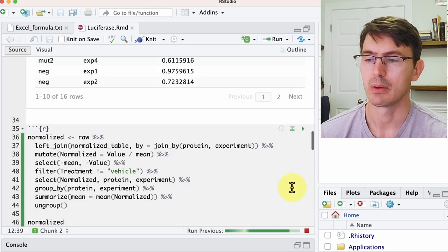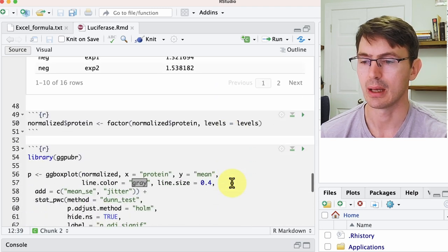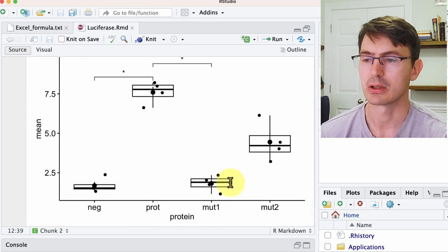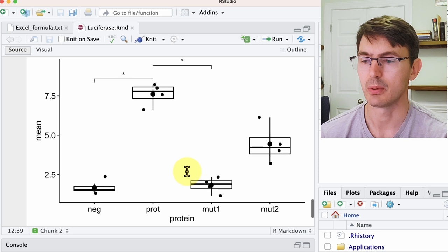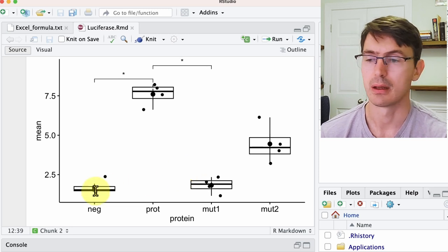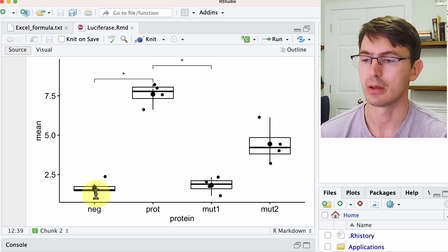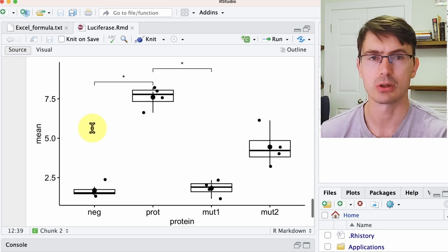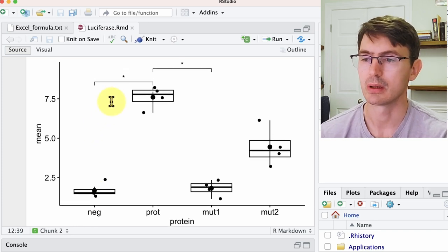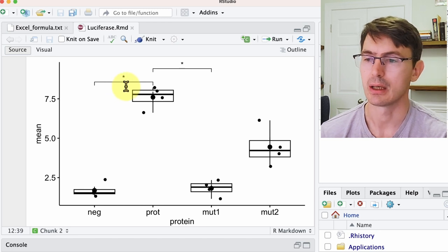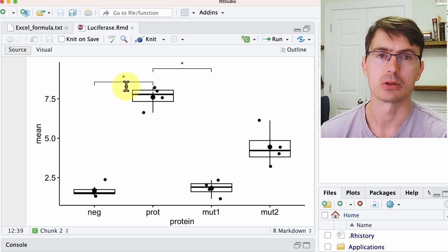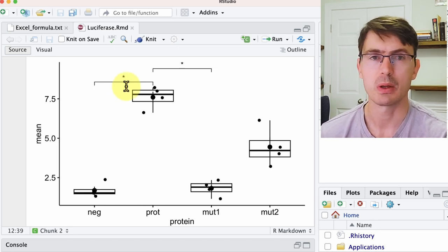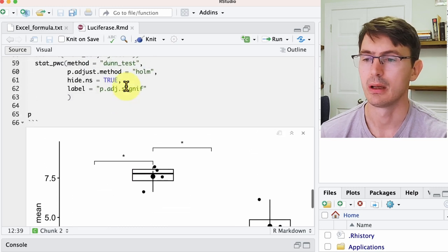So I have here the script, it's not that long. If we go ahead and run it, we end up with this almost publication-quality plot where you not only have the expression of the luciferase for the different conditions, but also you have the comparison between the different conditions and you have the statistics here indicating those that are significant.